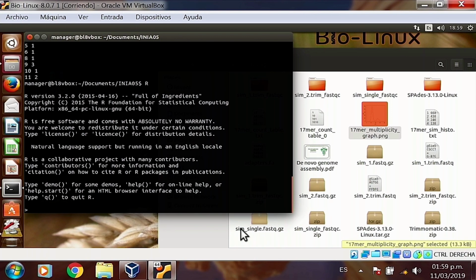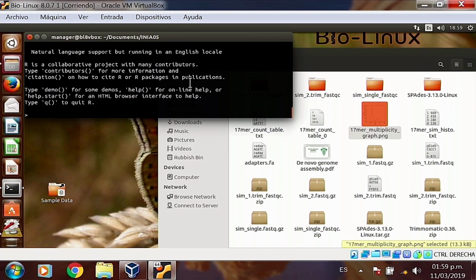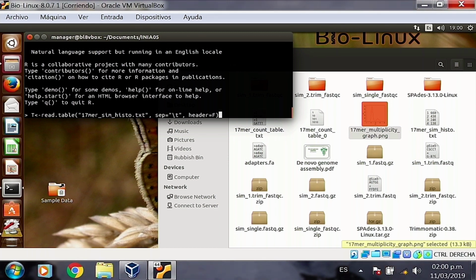Some of you use RStudio, some of us use just simple R, and the idea was to first just import it by using this command, read table, then the name of the file. Basically just use the read table command with 3 parameters. First, what is the file we're going to read? It's a text file. Second, how we're going to split that file and produce a table. That's what we use the sep equal \t.